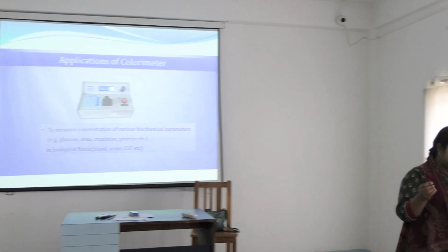So in our day to day life, or in our lab, we use to measure glucose, urea, creatinine, proteins etc. from different samples, not only urine. Until now we were dealing with urine only, urine sample only. Now from now on we will move to serum samples, okay, blood samples, and in blood, in biochemical parameters, all the biochemical parameters are mostly derived from serum. Cells we don't need.